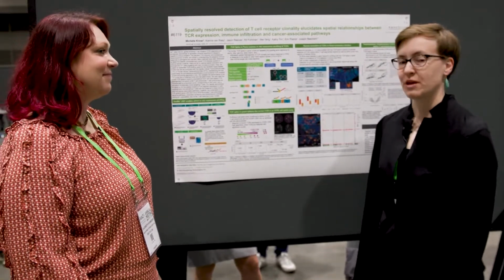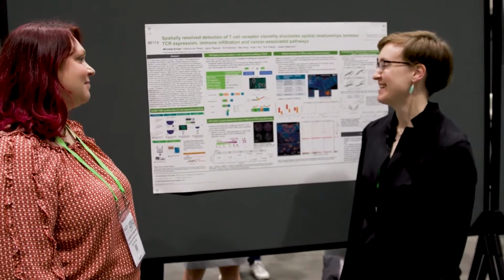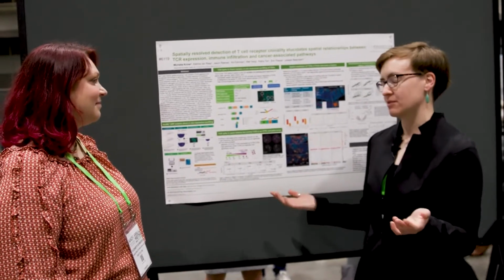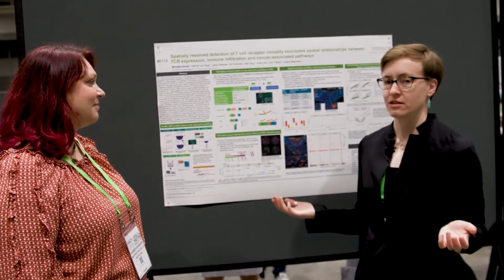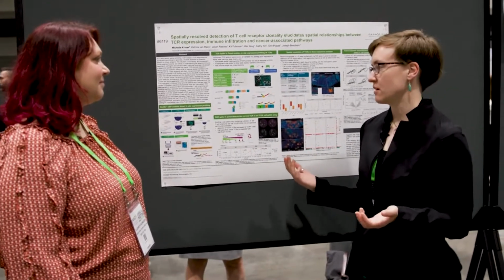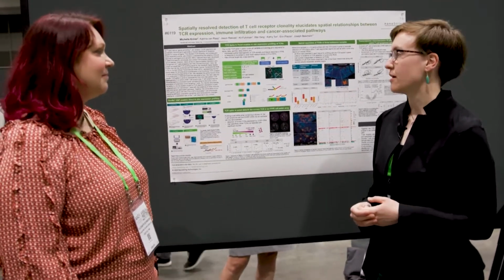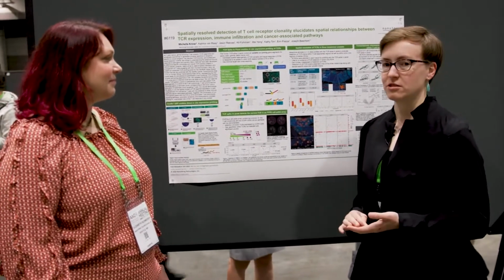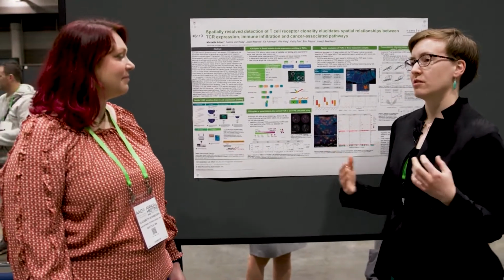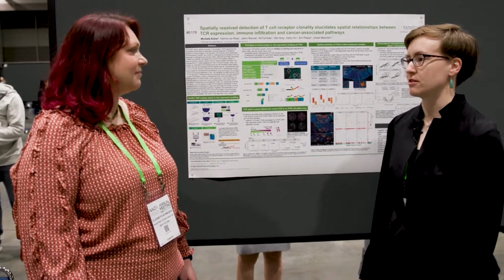Yeah, so for the GeoMx platform, we are developing a spike-in probe panel where we make probes to the different possible T-cell receptor gene segments that are encoded in the genome, and then we try to detect them in GeoMx samples to see which T-cell receptors are being expressed in a given region of interest. So this spike-in panel is designed to be used in combination with our WTA or CTA panels, so it gives the customer information. They get their transcriptome-wide information, but in addition, they get information on the T-cell receptor expression clonality.